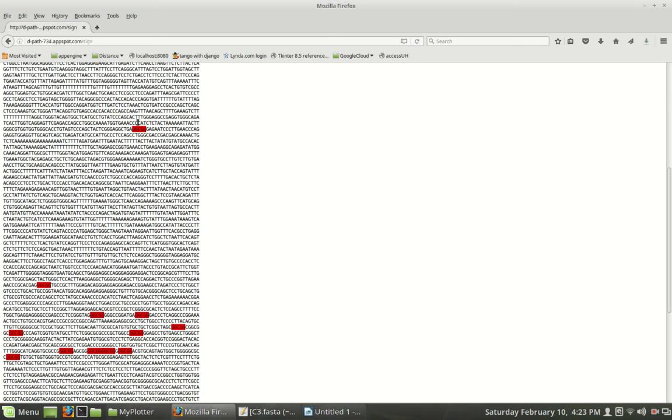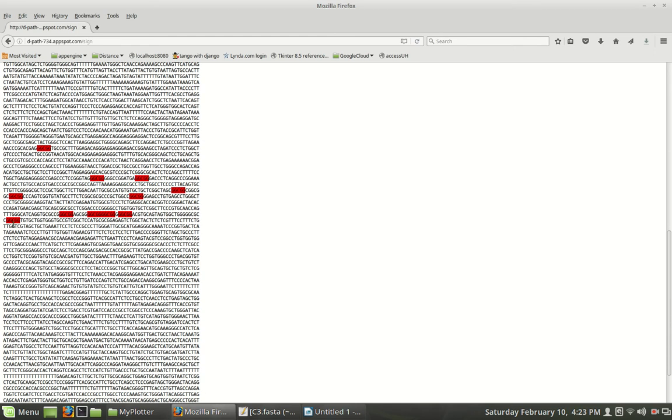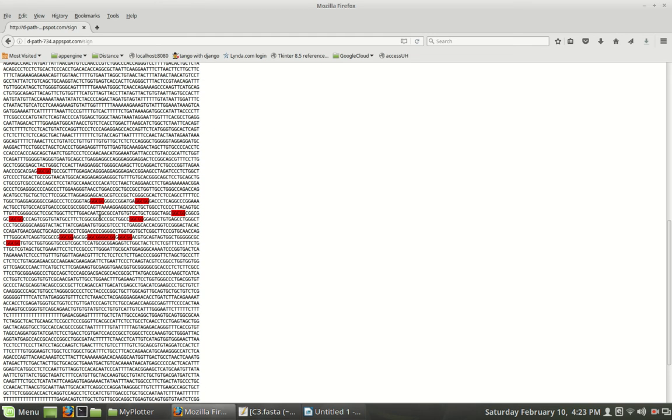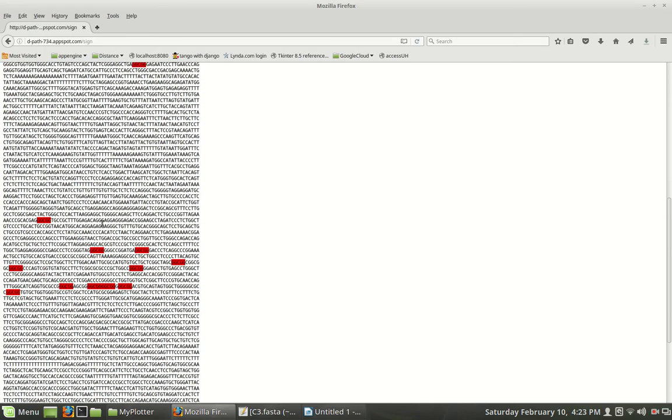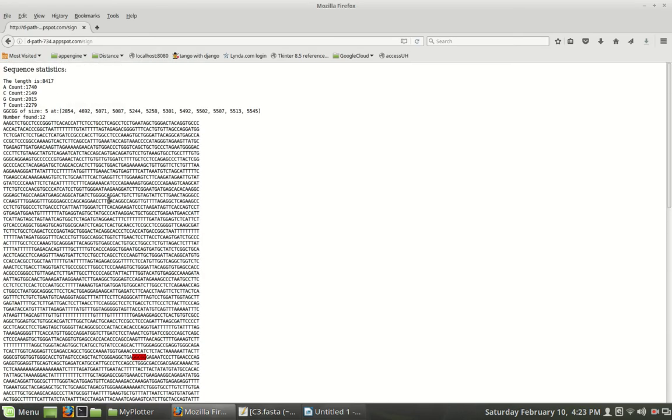All right. Probably not that one. Could be any of these. Since we have a kind of a double down here, you might consider that one plus one right after it. It's a very strong idea that this is it. But you have to put this in context with the rest of the sequence. Where is the CpG island? Where's the transcription start site? Where are the introns and exons? Everything does have to fit in the right spot.